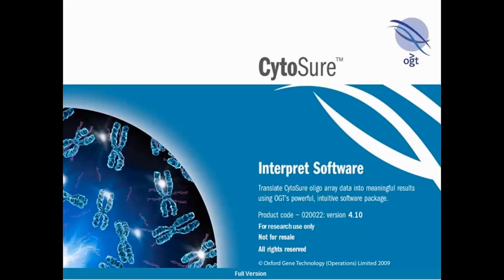CytoSure Interpret software has been developed in close collaboration with our customers to provide a flexible solution for labs with a wide variety of analysis requirements. As a result, a number of strategies are available in order to plan and execute interpretation and reporting of CytoSure array data. Strategies are loosely based on the array throughput of a lab and are categorized as high, medium and low array throughput. Users are encouraged to assess each strategy in order to select the one most appropriate for their situation.